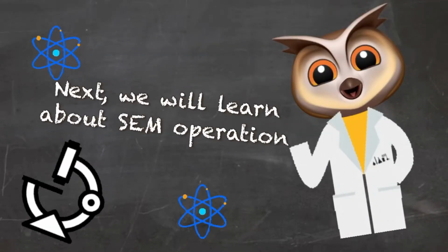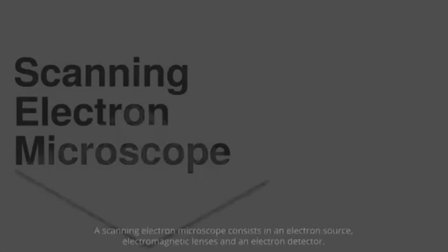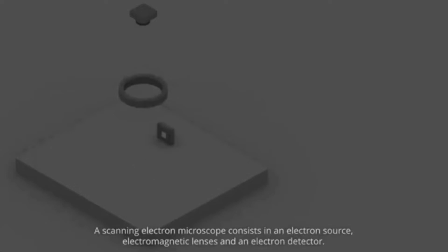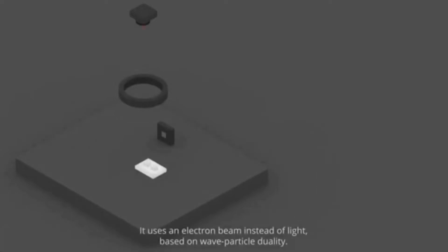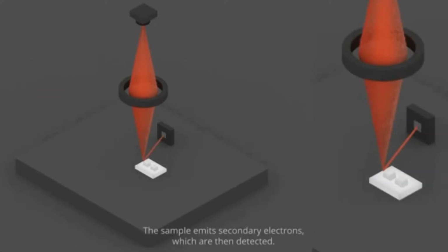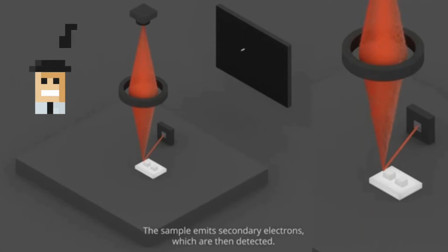Next, we will learn about SEM operation. What are the internal components of SEM? A scanning electron microscope consists of an electron source, electromagnetic lenses, and an electron detector. It uses an electron beam instead of light, based on wave-particle duality. The electron beam is accelerated and focused on a sample using the lenses. The sample emits secondary electrons which are then detected.